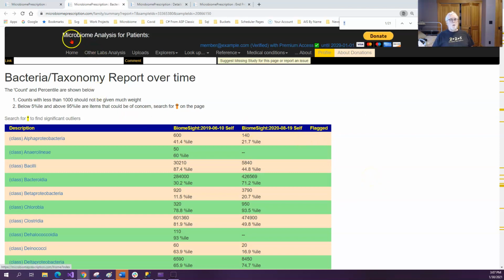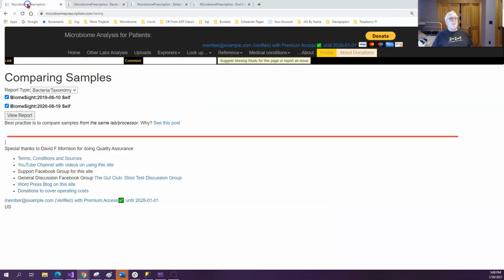Switching over to this format was done because the amount of information you have on comparing samples has now grown to relatively obscene numbers, as in literally thousands of items to compare. That's a lot of scanning, and having it pre-scanned and flagged makes it easier.